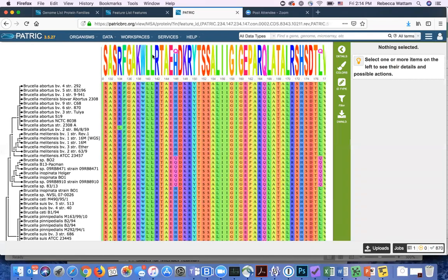And then across the top, this is something called Web Logo that's summarizing very quickly for you the data below.